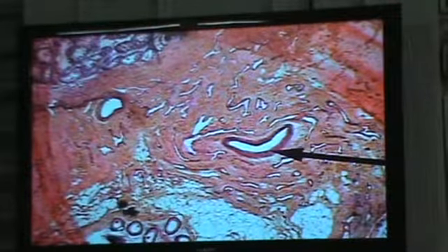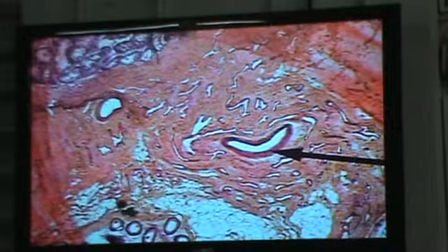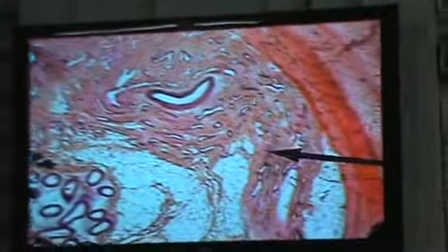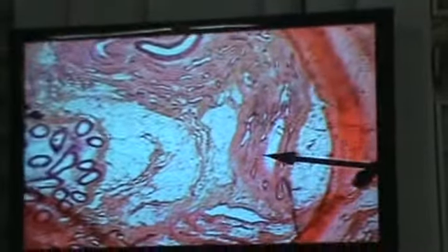Okay. Beautiful. Excellent. What do we see? Immediately we see the second area, and what do we see in the second area? Irregular spaces. Very good. So this is the area of the mediastinum testis right here.